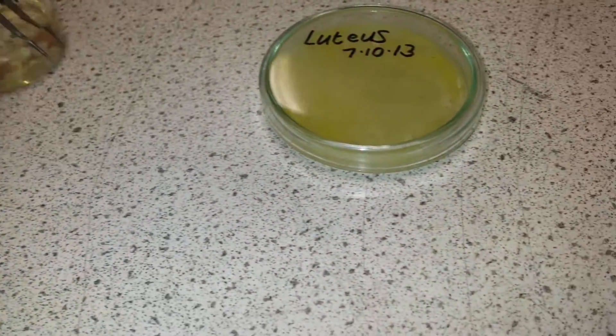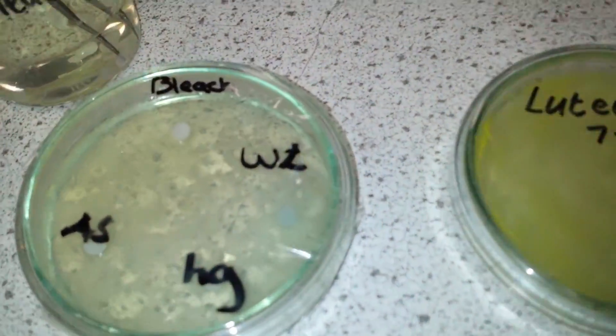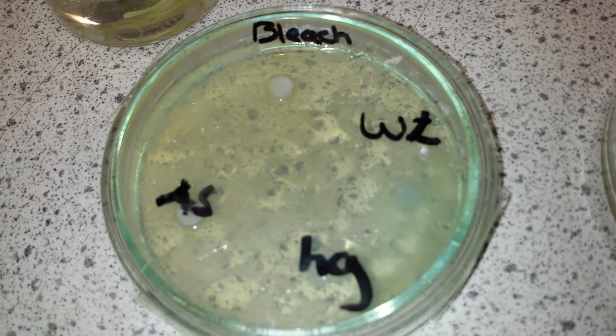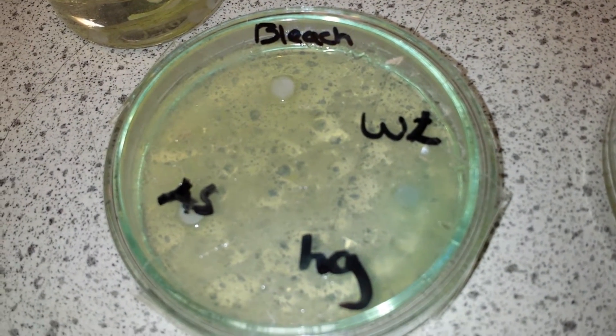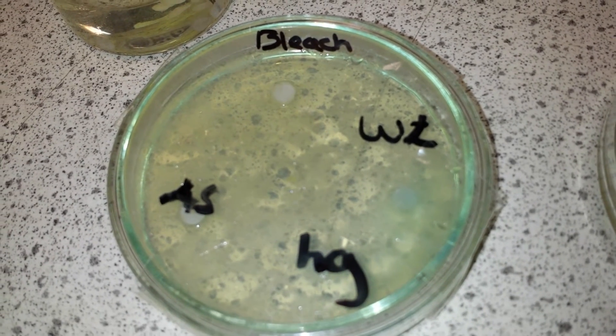I put the lid on, and here's one that I've already prepared earlier. You can clearly see that we've labelled all of the samples — there's a small disc with bleach, one with hand gel, and various other antiseptics.